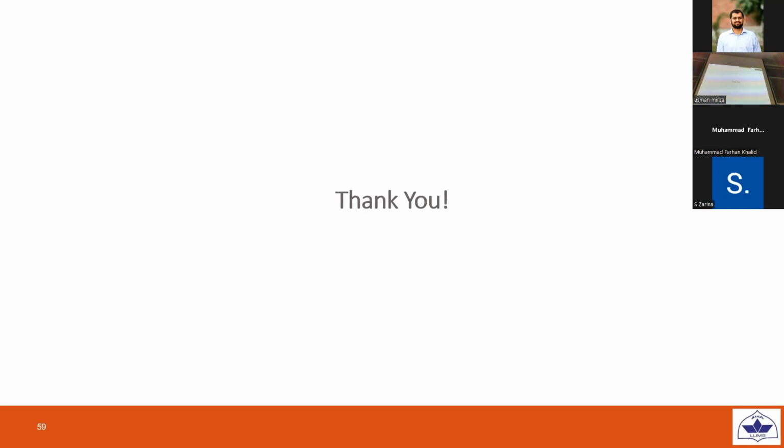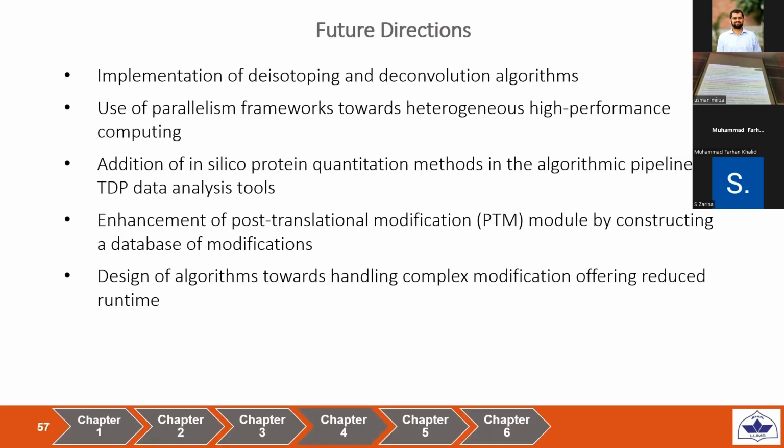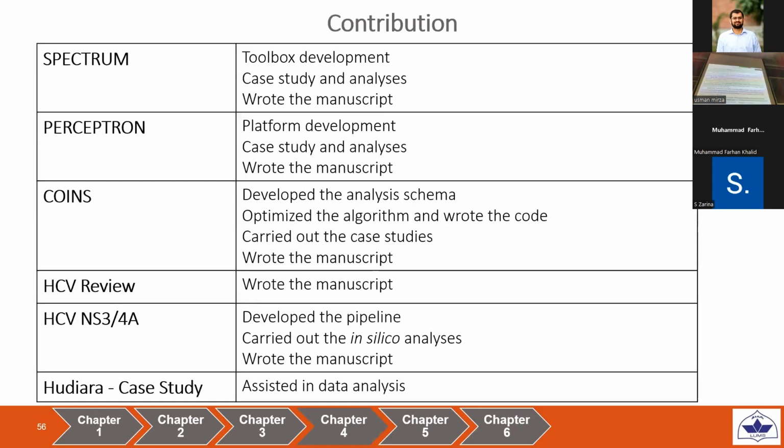So the first one, what we do is we take the datasets and benchmark them against the available toolboxes. We replicate those search processes and identify the proteins reported by those toolboxes, keeping in mind that both the parameters for our pipeline as well as the pipeline engaged are similar. Second, the experimental validation for this overall process. We are talking about the computational pipeline, so we have not looked into the experimental validation for this.